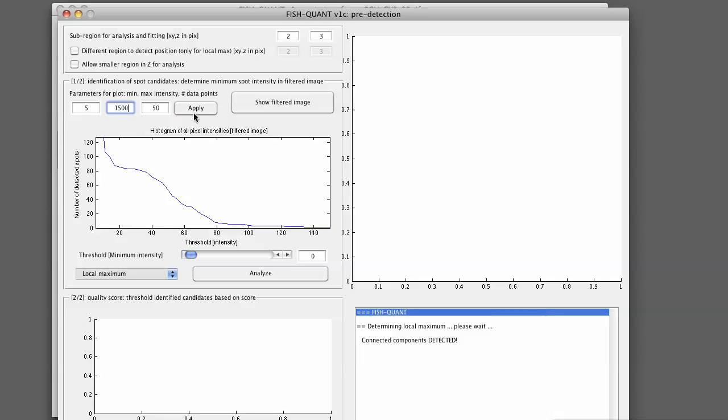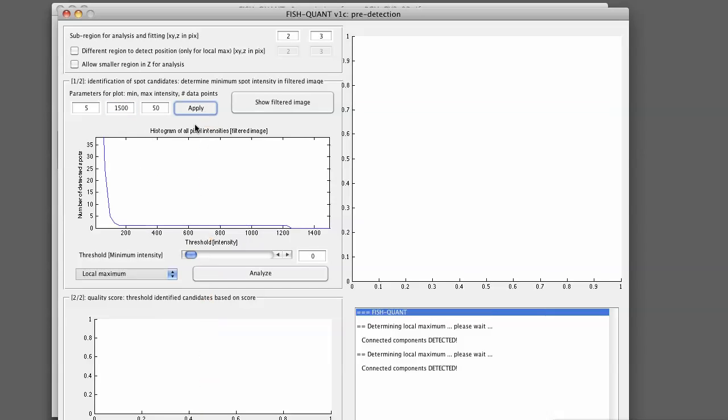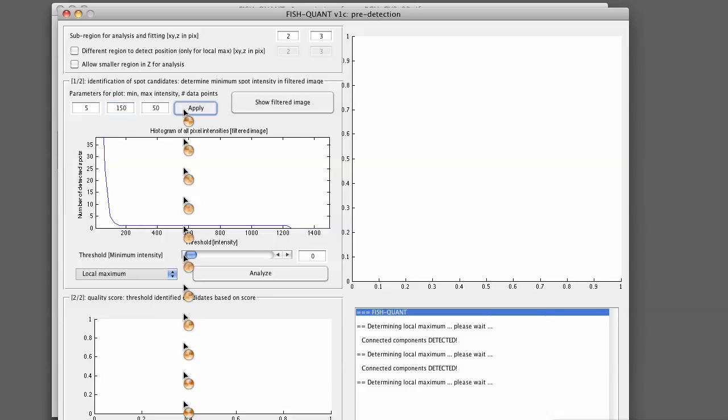Press Apply. So you see now that intensity thresholds up to 1500 were tested, which are way too high for our experiment, but might be interesting for yours. So we go back to 150.